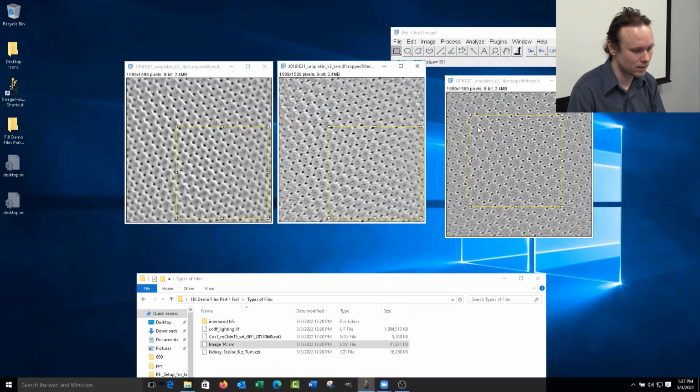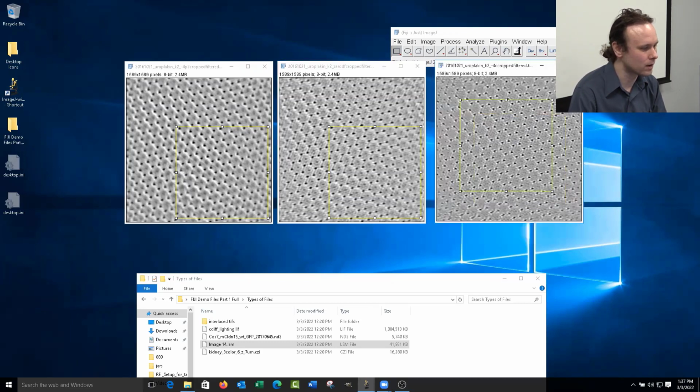I think you would have to add a new scale bar. It'll know the scale information, but it won't have just your bar though, right, in FIJI, because that requires user input to decide where you want a bar. Yeah, but let's do that now.